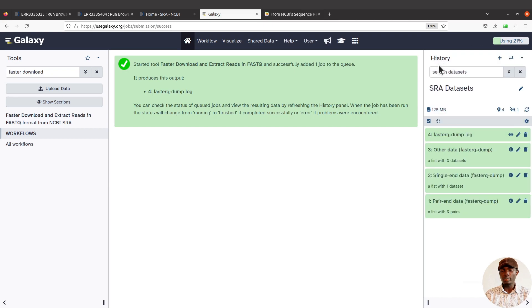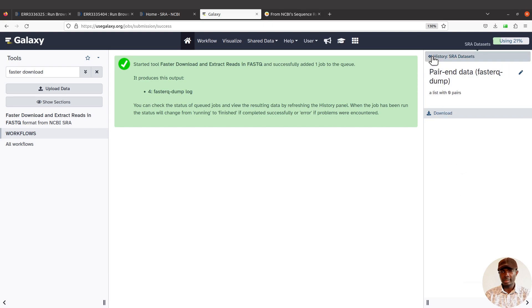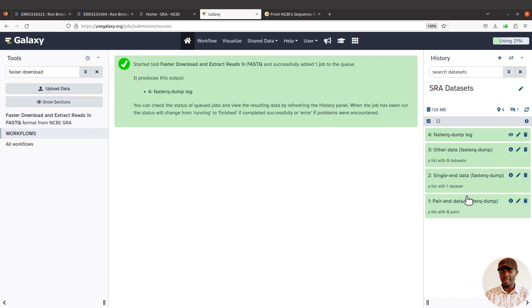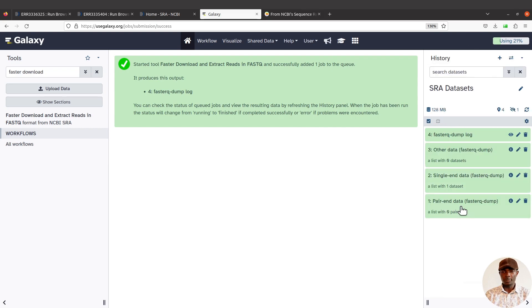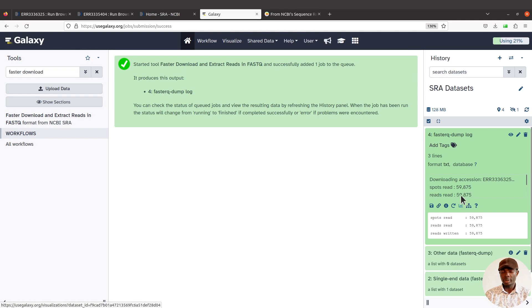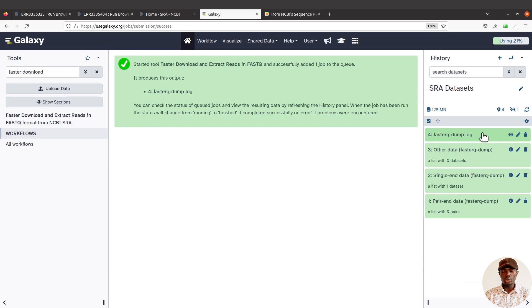Because we used a single-end accession ID, the single-end collection has data in it, while the paired-end collection will be empty — zero datasets. The other data output is also zero. You can remove those empty collections. The FASTQ-dump log file is useful — you can check it to see what was done and get more information. This is how we import single-end data from the SRA database. Now let's try it with paired-end data.